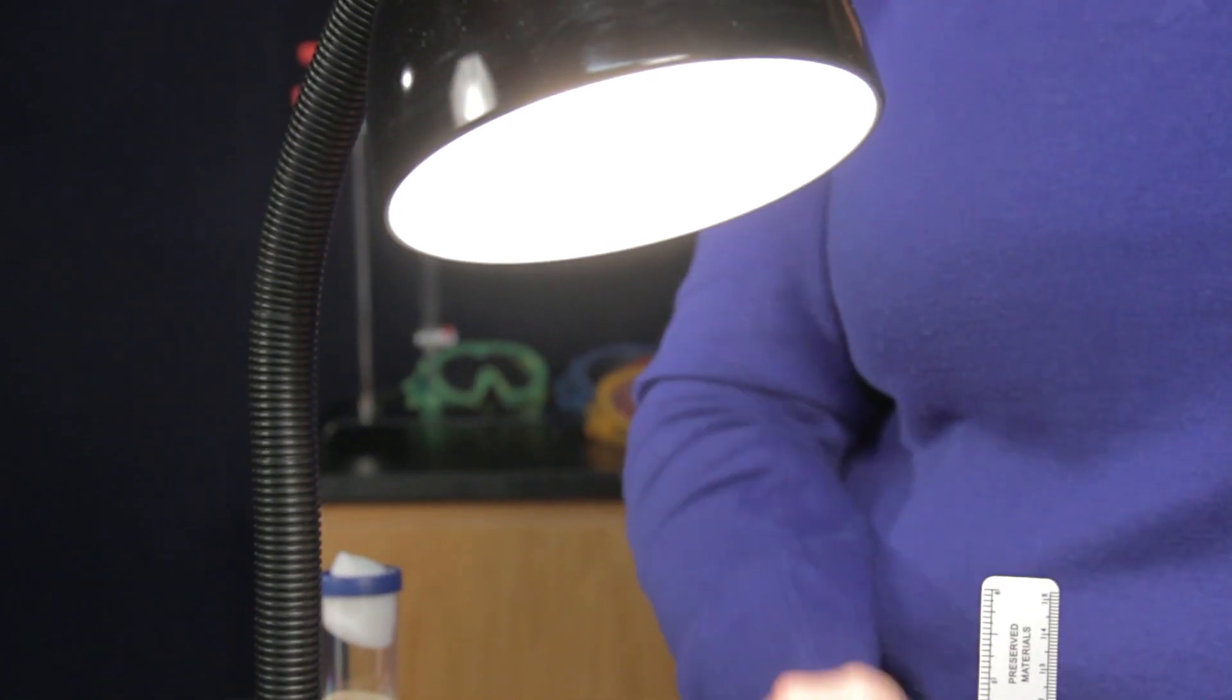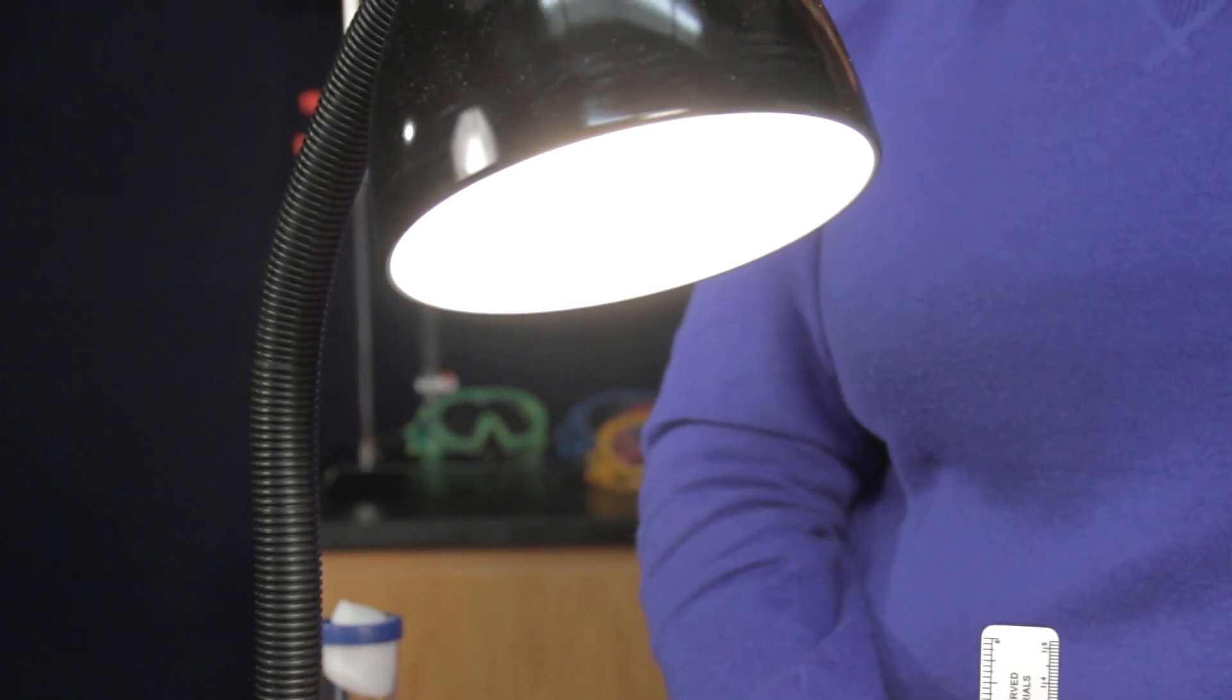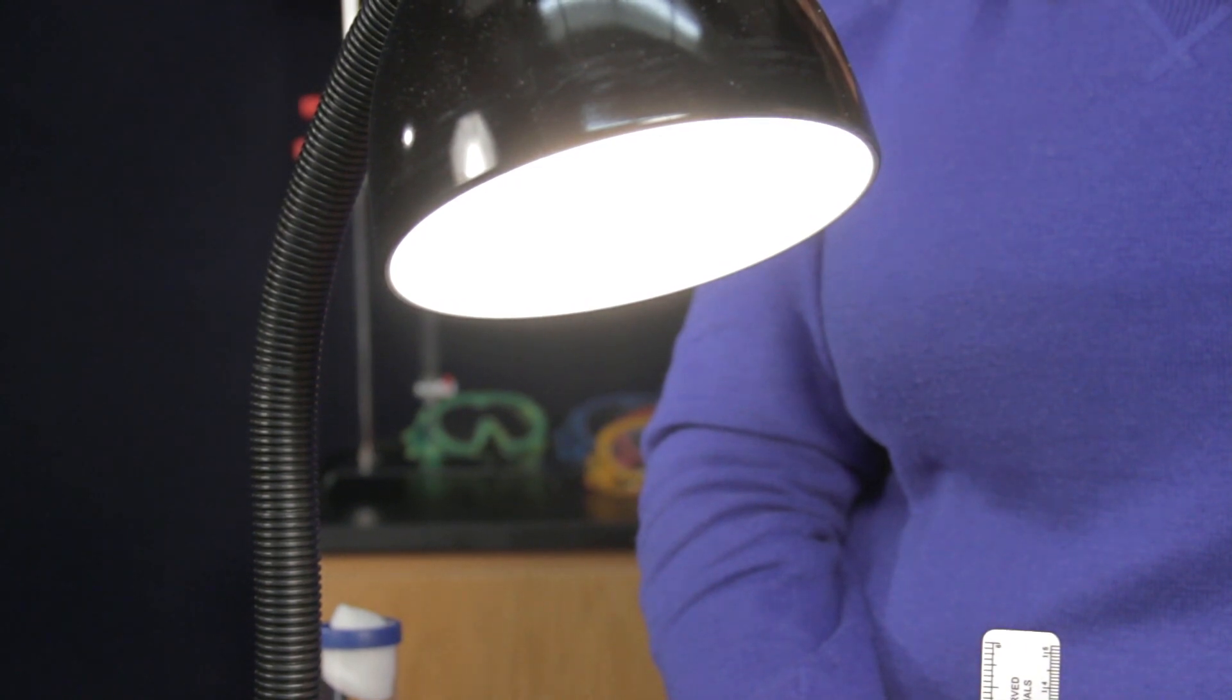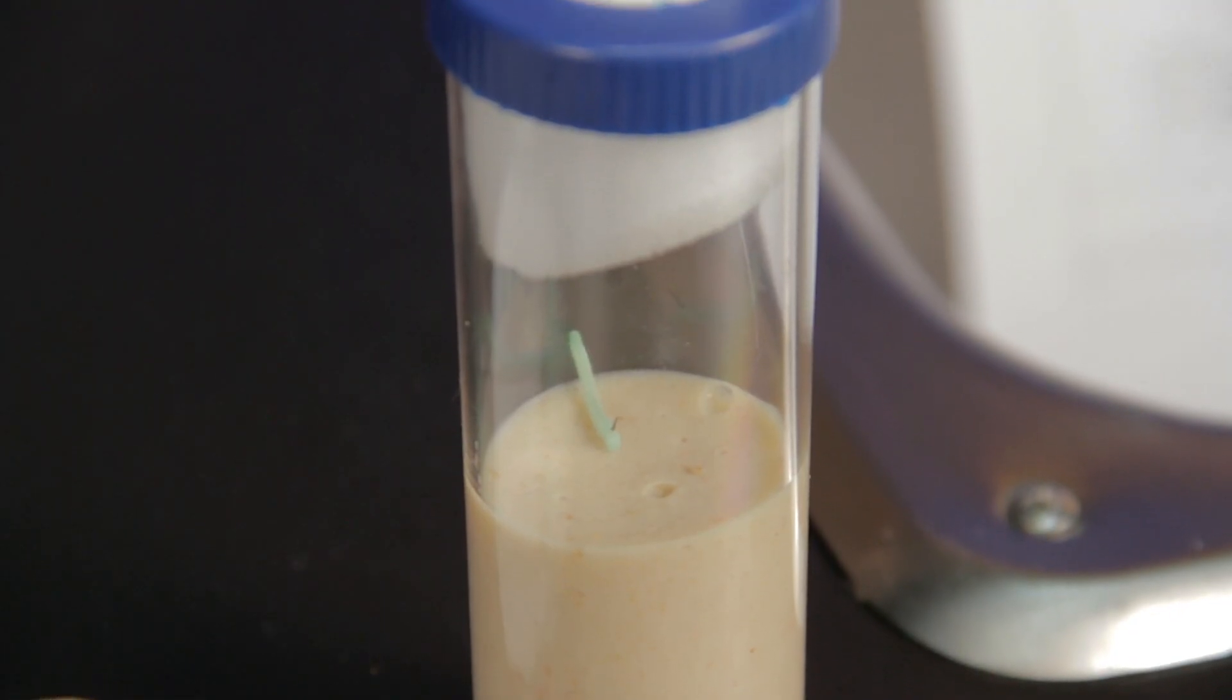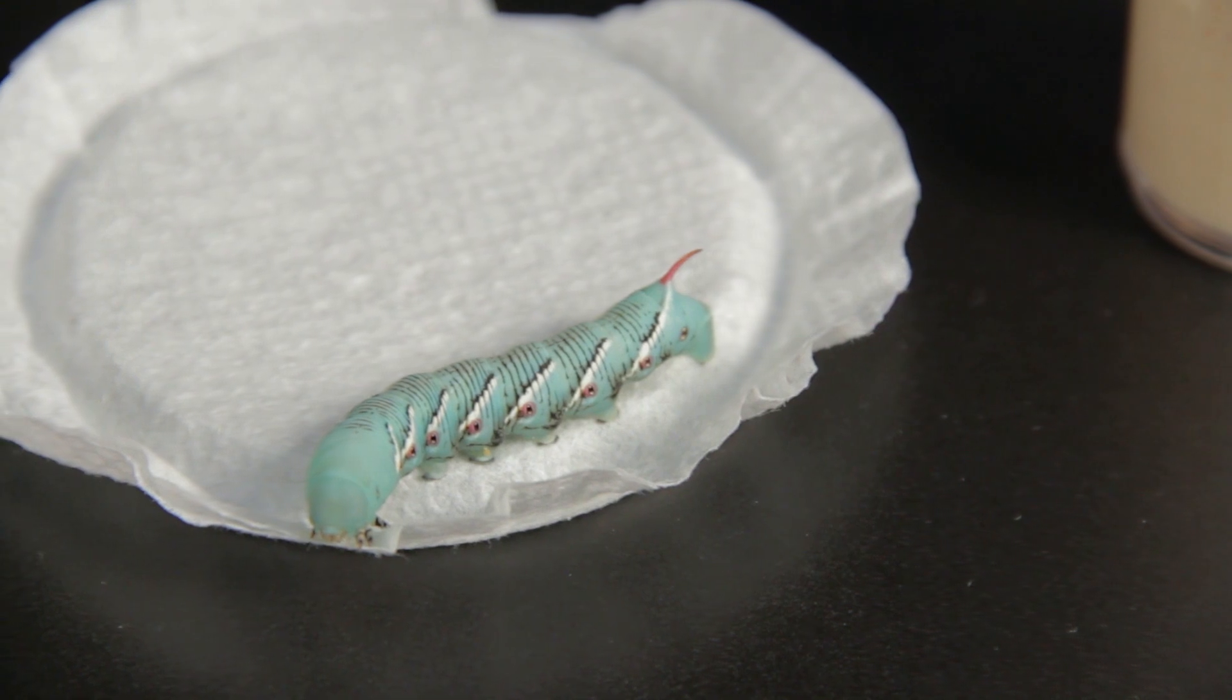Keep the larvae in constant light to avoid an extended pupil stage. Observe the larvae eat, grow, and molt over the next two to three weeks.